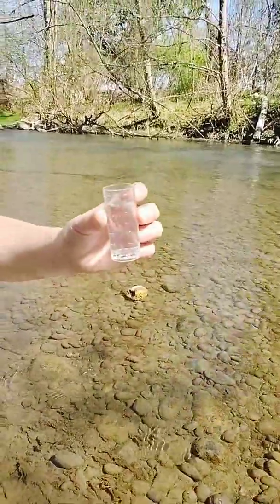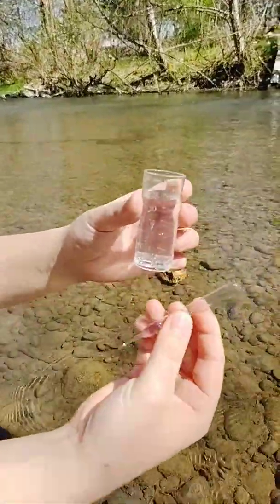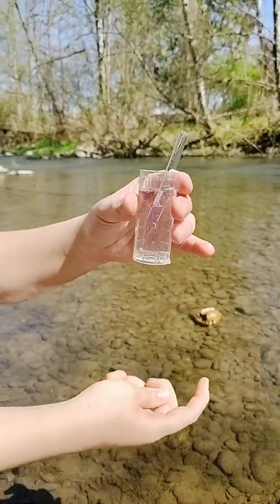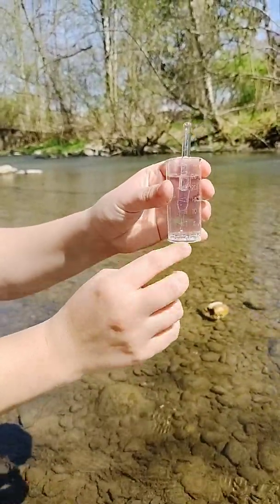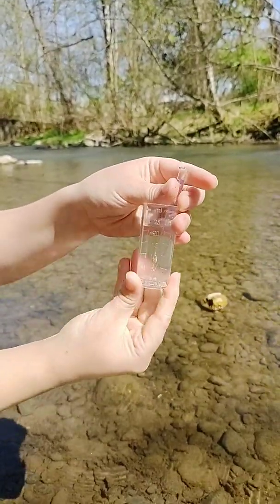Alright, we got about 25 here. And then we're going to take this, what's called an ampule, this little test thing here, and we're going to stick it at the bottom. Now it might be kind of hard to see, but there's little notches at the bottom of this tube, and we're going to actually break that glass tip off. Alright, I just did it there.